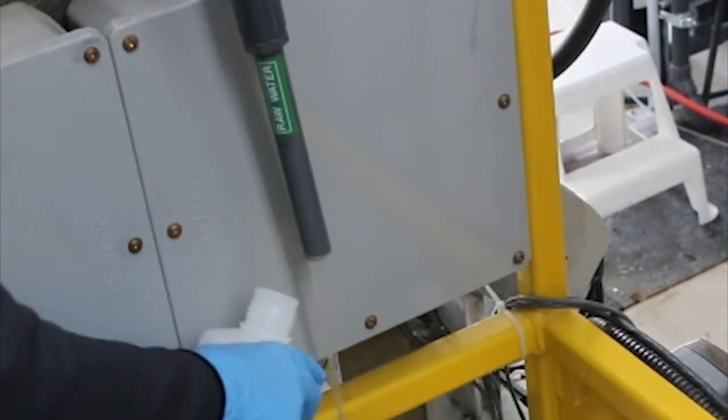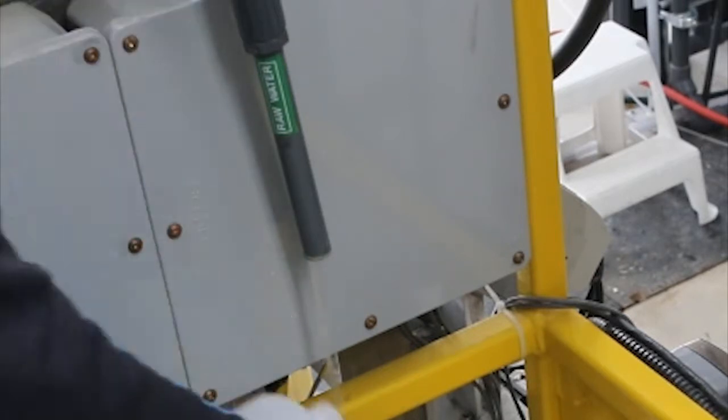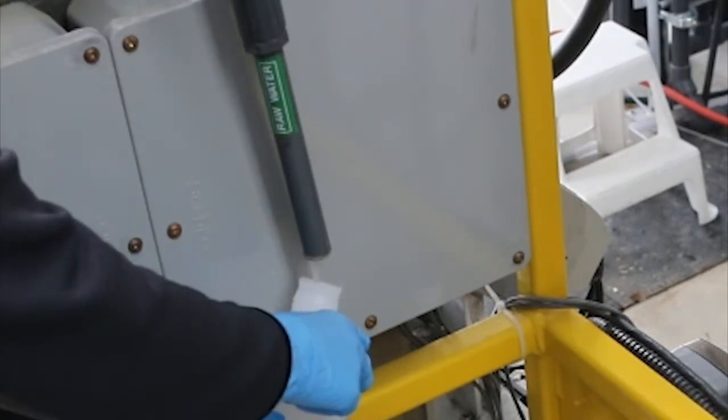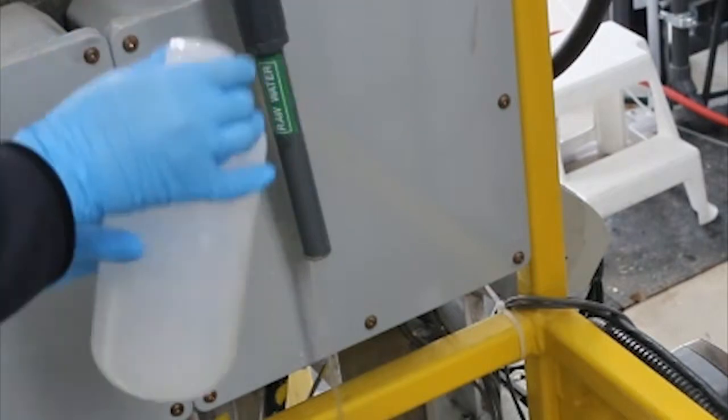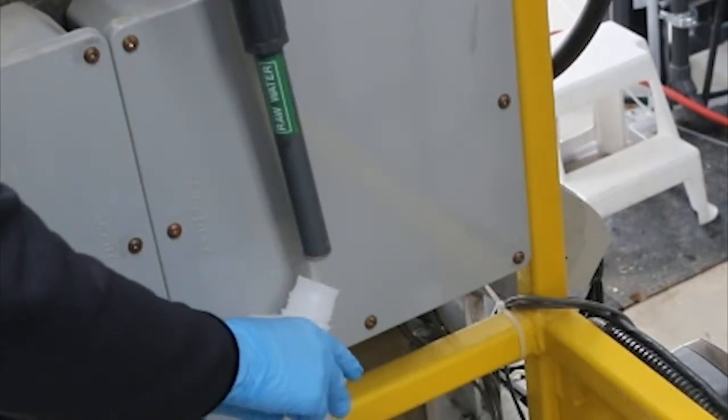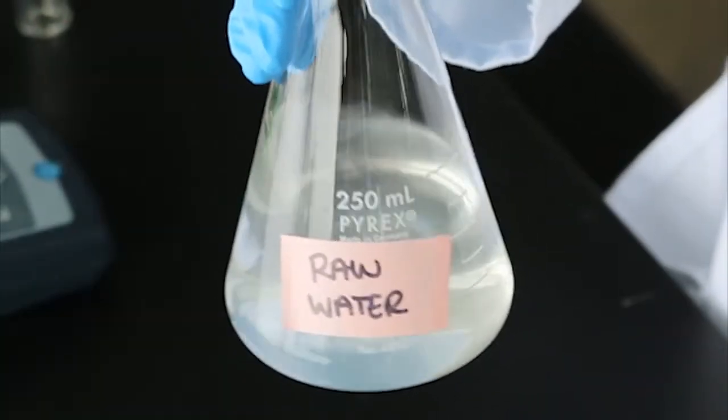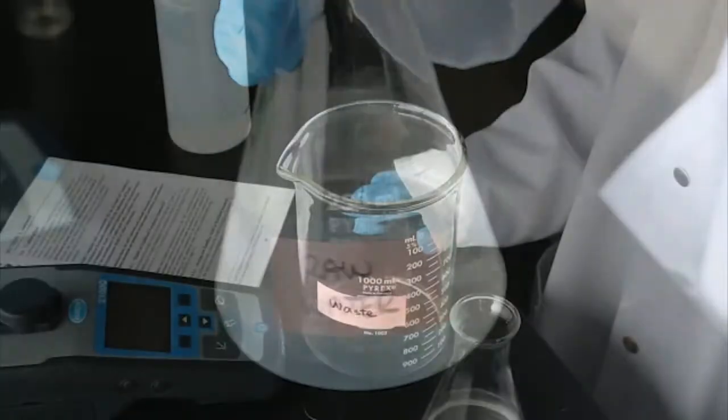Collect a representative sample of your water in a clean container. Analyze the sample as soon as possible to prevent temperature changes and particle settling. Gently agitate the sample before testing to ensure you obtain a representative measurement.